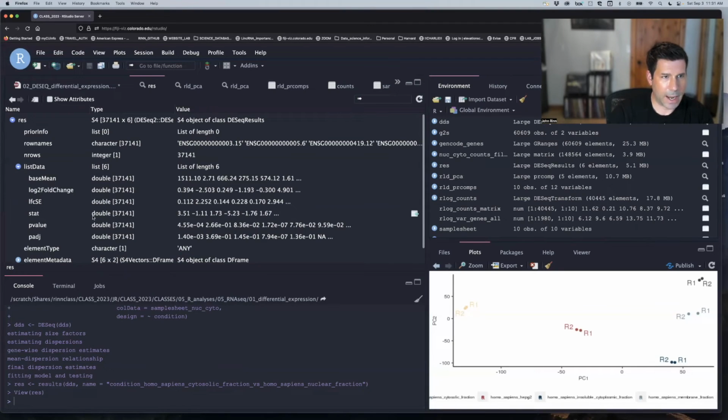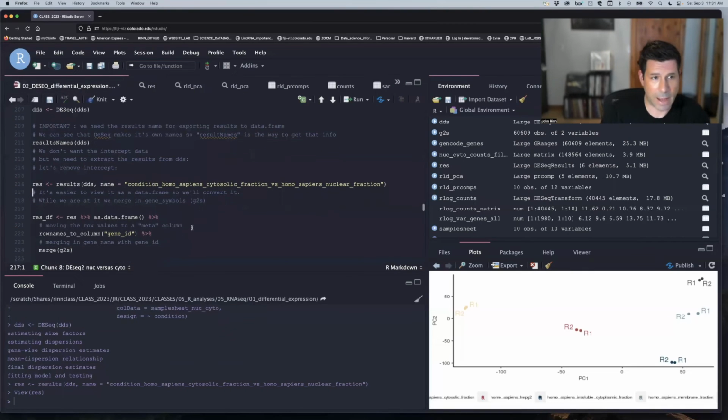we can see what we got out of that is the base mean, the log fold change between nuclear and cytoplasmic, the p-value for that change. And this is exactly what you would want. If you're comparing 2 conditions, we're going to say these genes are enriched in this condition and these ones are not. We already have the answer of what genes are more nuclear than cytoplasmic inside that results data frame, which I'm just calling res.